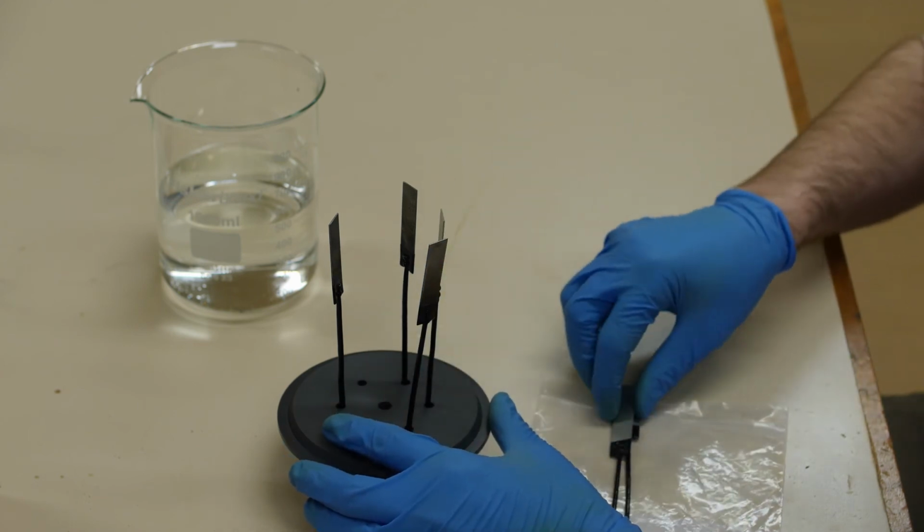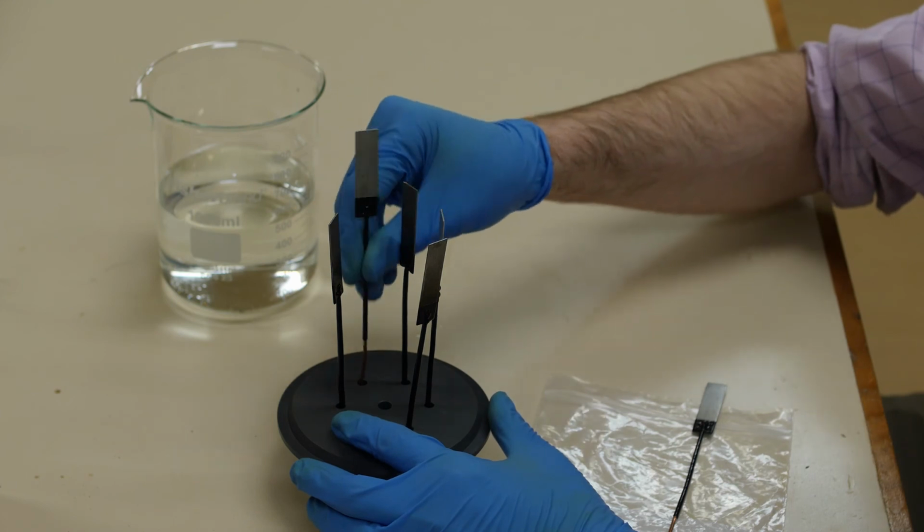Then, the zinc coupons are inserted in between the steel coupons.